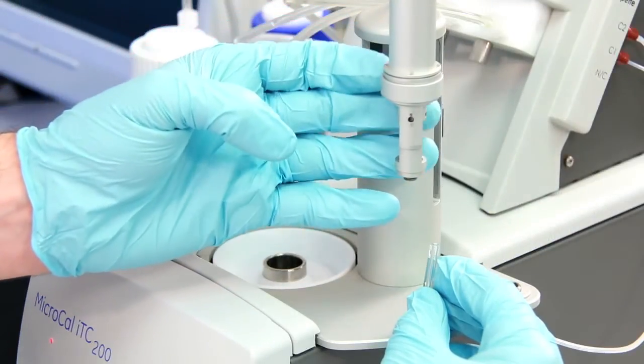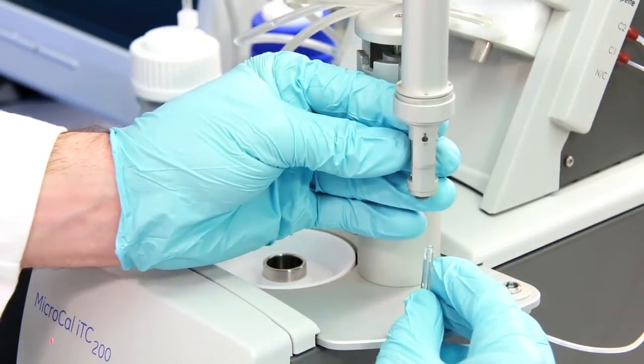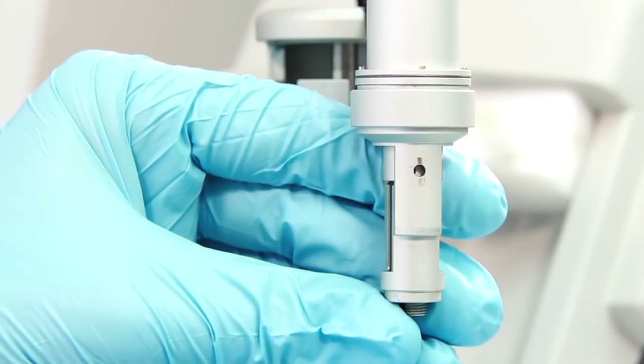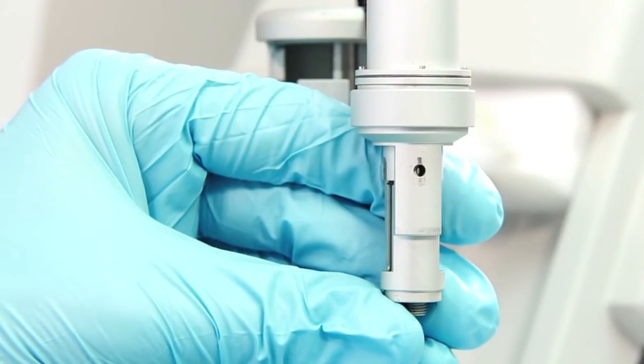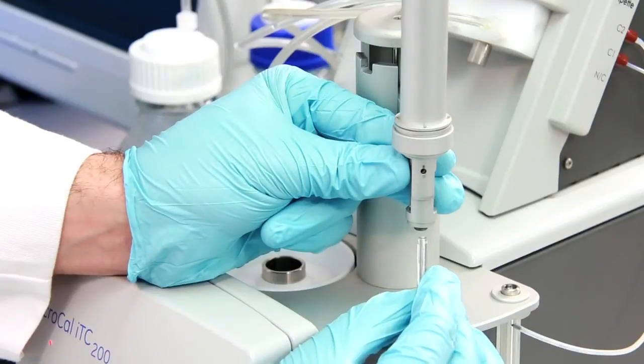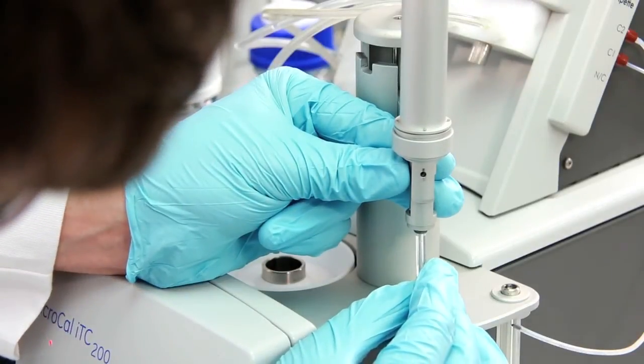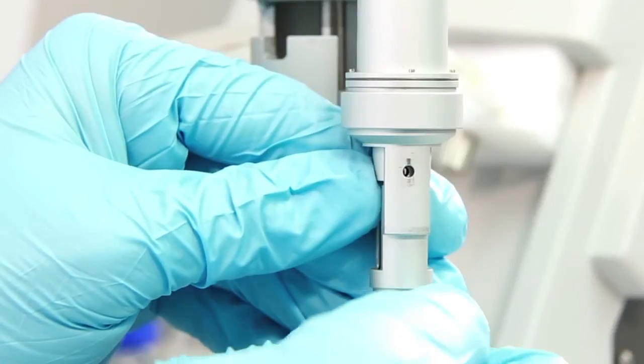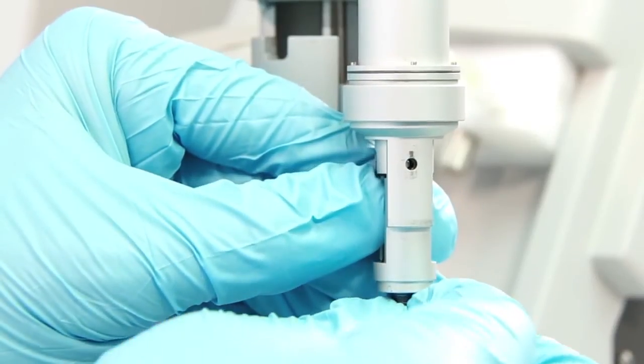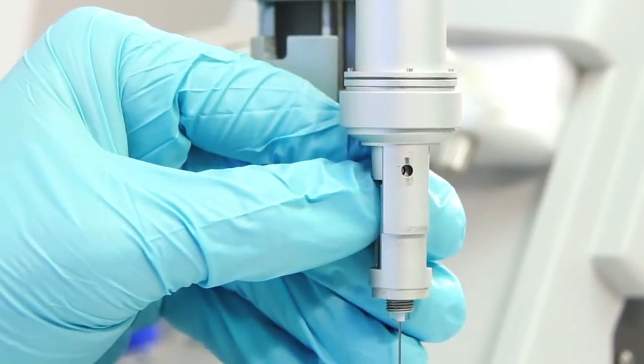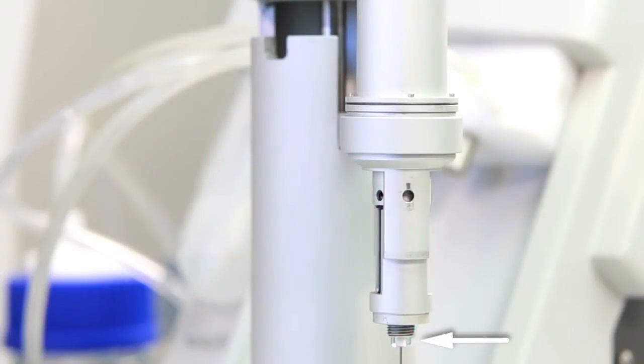Now bring the pipette over and align the two holes in the pipette, one in the rotating piece and one in the fixed frame piece, to each other. Carefully push the syringe up into the pipette body so that a couple millimeters are exposed.